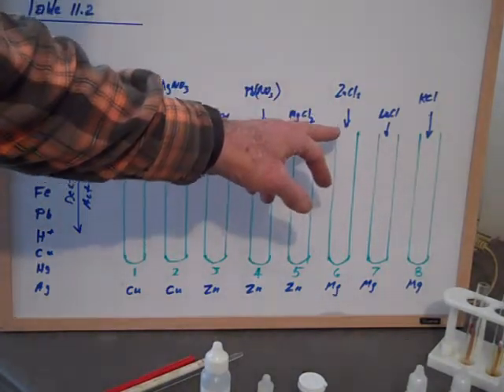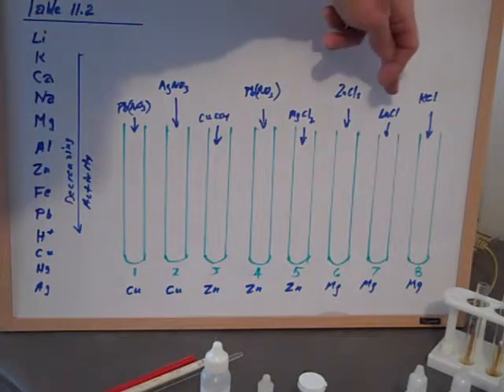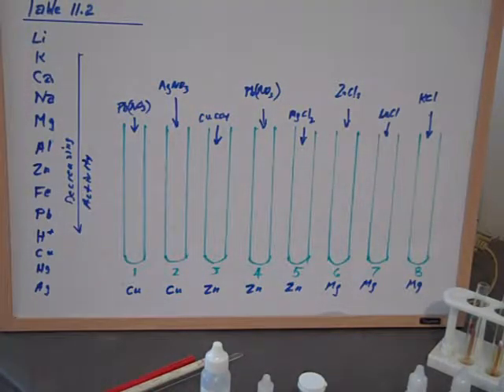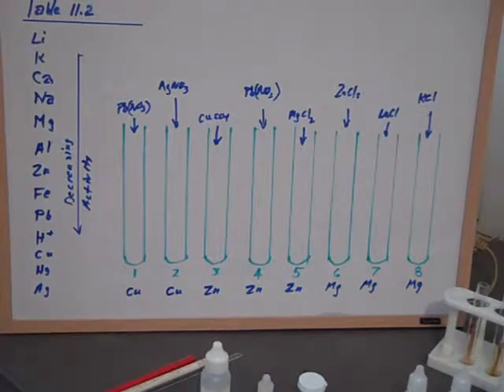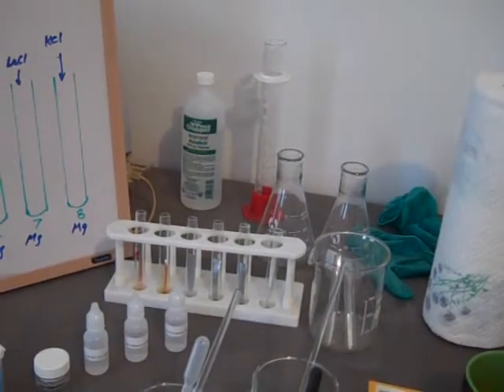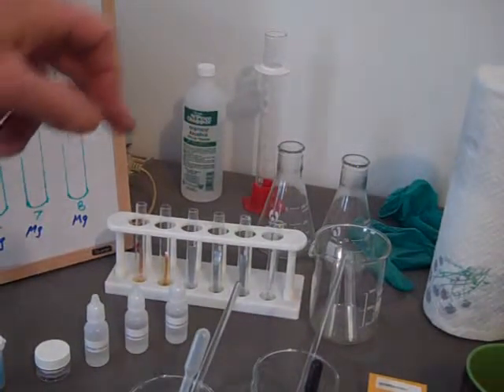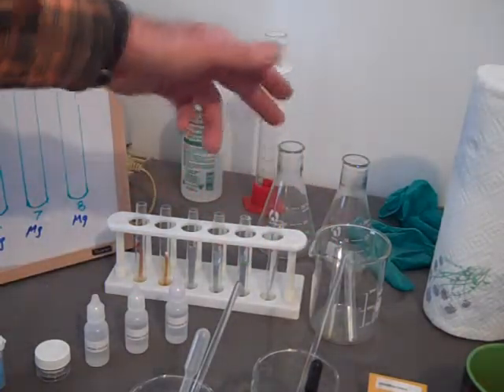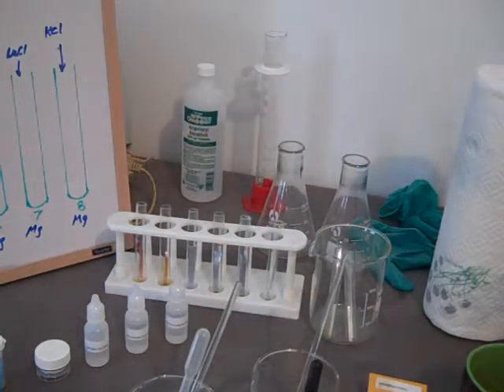The next one again, or for the first time, is zinc chloride, then sodium chloride, then potassium chloride. And we're going to put, just open this up quickly. Again, we haven't done this yet, so you'll just watch along as it's done. I guess five drops to each one, approximately, of those different ionic solutions. And we will move the camera so you can see us doing that, and we'll observe what happens. There's the test tubes, and there's the other two test tubes on the right, over here, because I didn't have enough places to put in our test tube rack. And there's the chemicals in order.